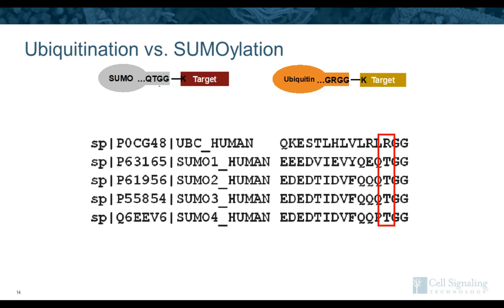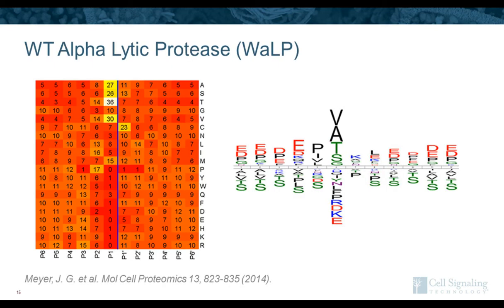It has threonine residues, so you can't cleave it with trypsin. So ideally what we wanted was an enzyme that would cleave after threonine residues, but not at arginines. And that enzyme actually exists.